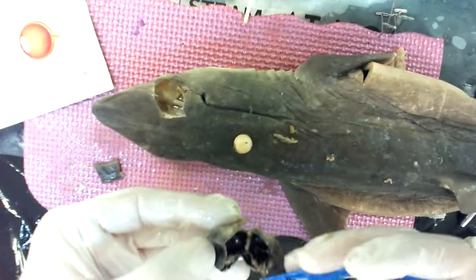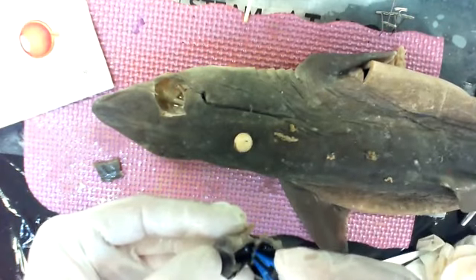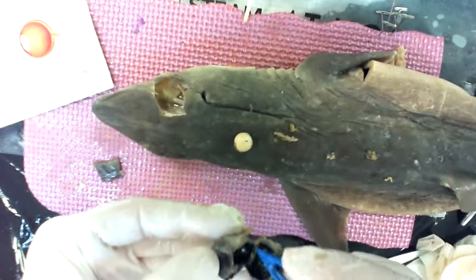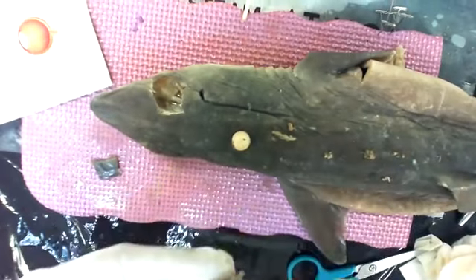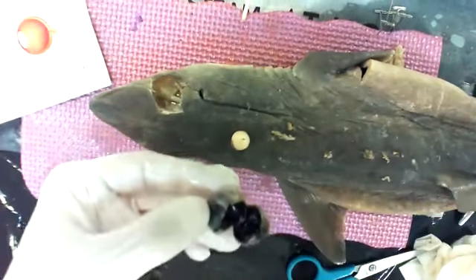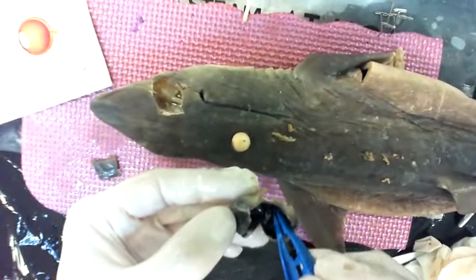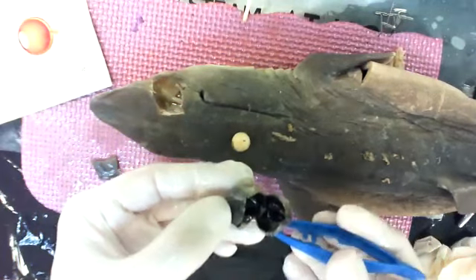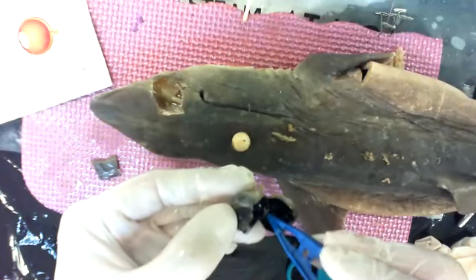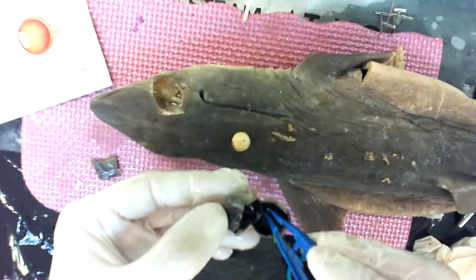If you ever make it to one of our stems in class, we play with vision a lot for the neuro stem, and we test your blind spot. And it's weird because you know you can't see, but your eyes are actually seeing in that spot where you can't see. It's so crazy. Right, there it is. So the optic nerve comes in right about where this fold's at, and there's a light colored spot right there. That's where all of the colored cones are.